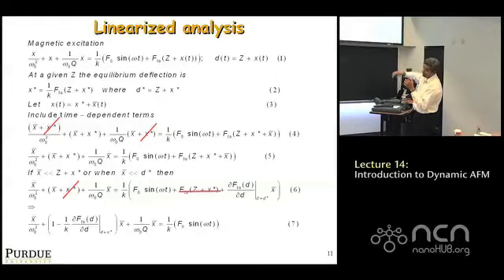Okay? So what it means is, under equilibrium conditions, the attractive force due to interactions equals the restoring force from the cantilever, right? There's going to be a balance between the two, and the X location at which they balance out is X star. That's it. Okay?